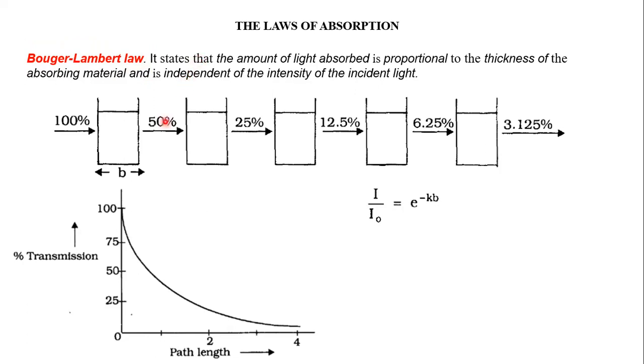So when we are talking about a gelatin sheet which is red in color, then what happens to the white light falling on the gelatin sheet is that all other visible colors are absorbed by the gelatin except the red color, right? Maybe it is not liking that red color. So red gets transmitted out. So it is absorbing all other visible colors except red. So there is an absorption happening there.